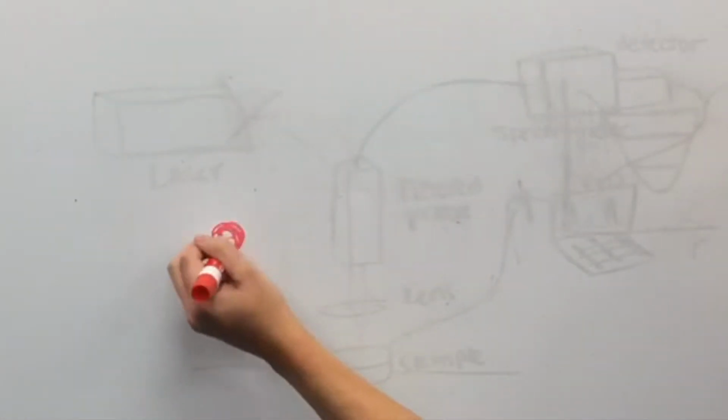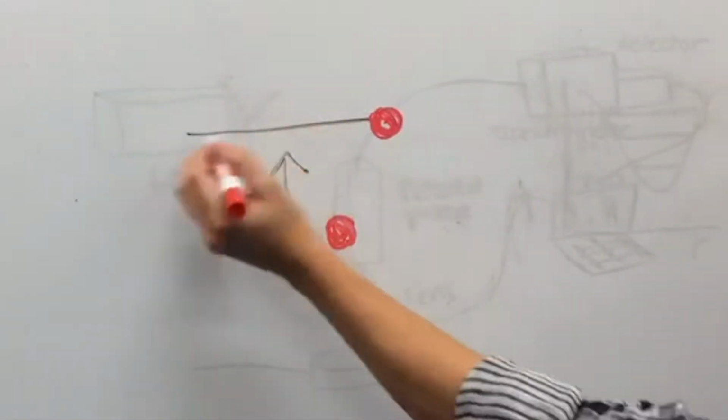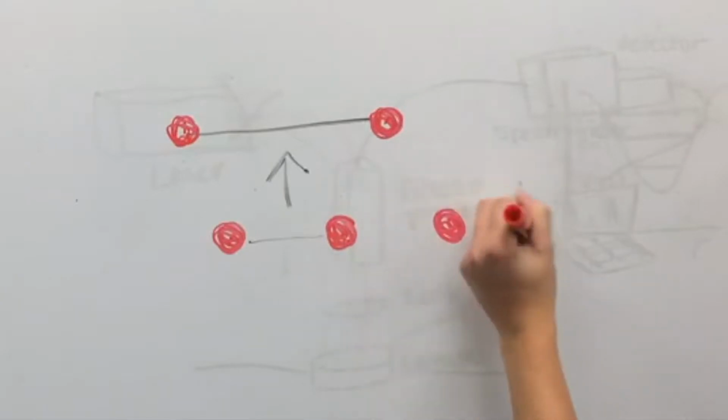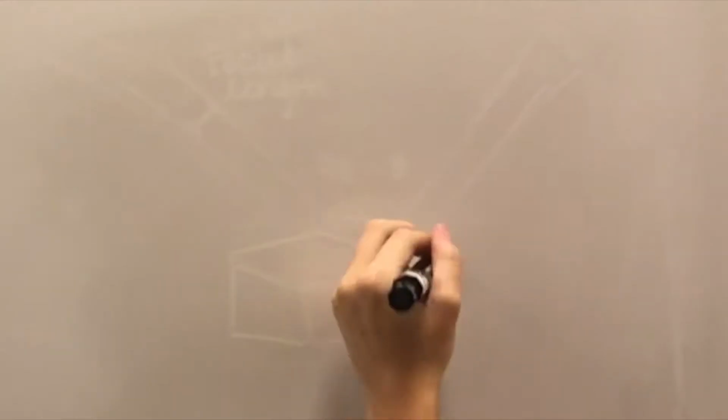There is a computer that, one, controls the whole system and, two, displays the spectrum and enables analysis of information. Molecules have characteristic phonon modes which can be found in literature and also match to resulting spectra.